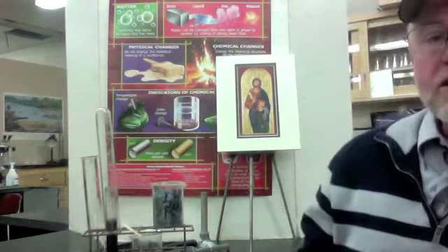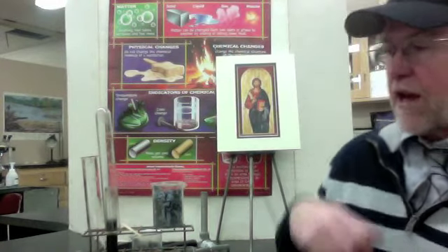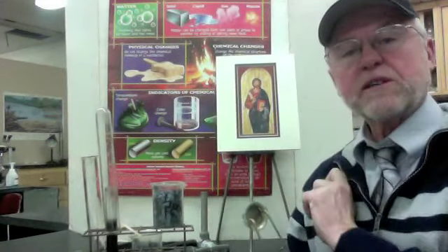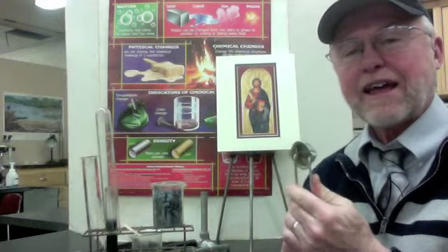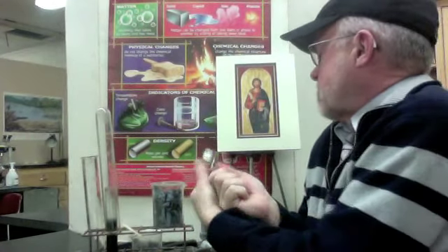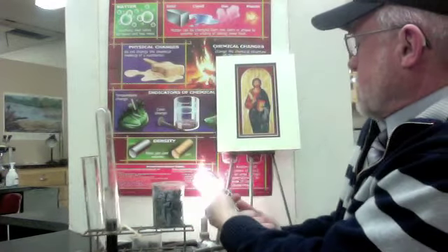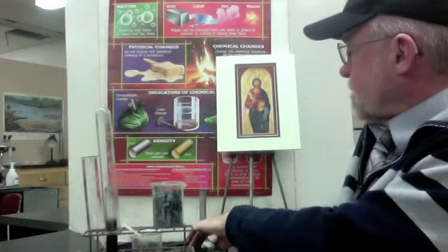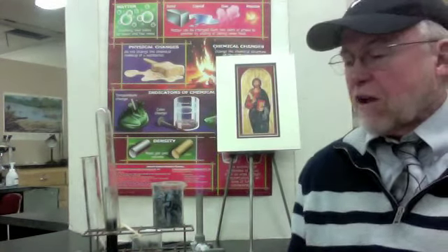So again, we're going to start this combustion reaction where we have natural gas, which is mostly methane, mixing with oxygen. Of course, just mixing with oxygen is nothing. I got to add the activation energy. Here we go, activation energy. Flame on. There it goes. Okay, don't get too close to the master teacher there. Okay, gotcha. So I've got my flame.